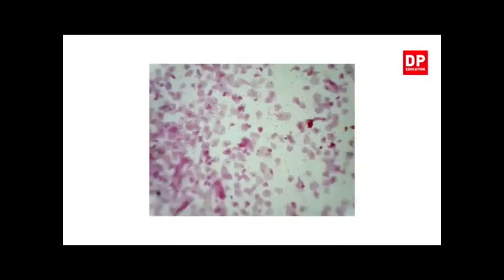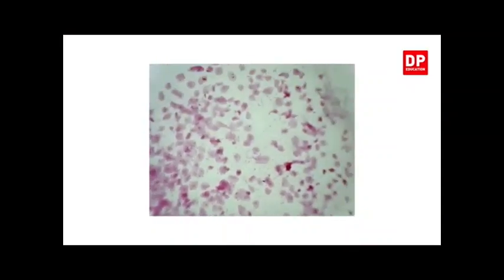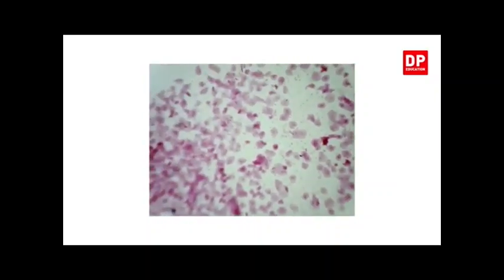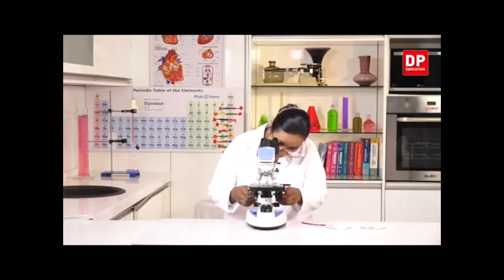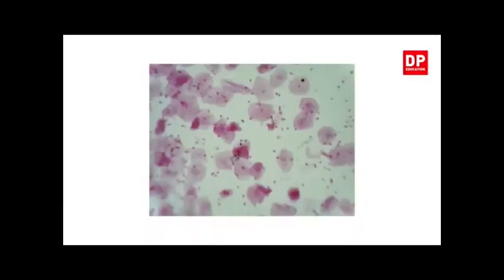So now I am going to do the adjustment. I am going to move the coarse adjustment knob so that the lens moves. As you can see, I will first bring it down and then I will move it upwards.